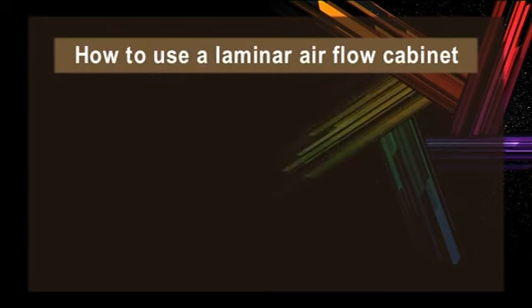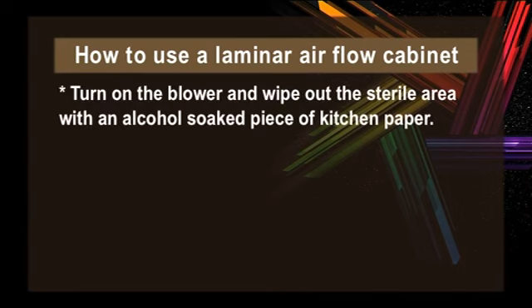How to use a laminar airflow cabinet? Before you start working in your laminar airflow cabinet, you should do the following actions. Turn on the blower and wipe down the sterile area with an alcohol soaked piece of kitchen paper.